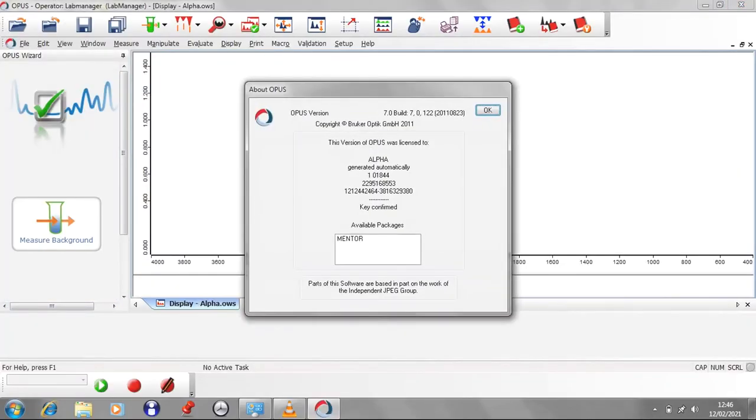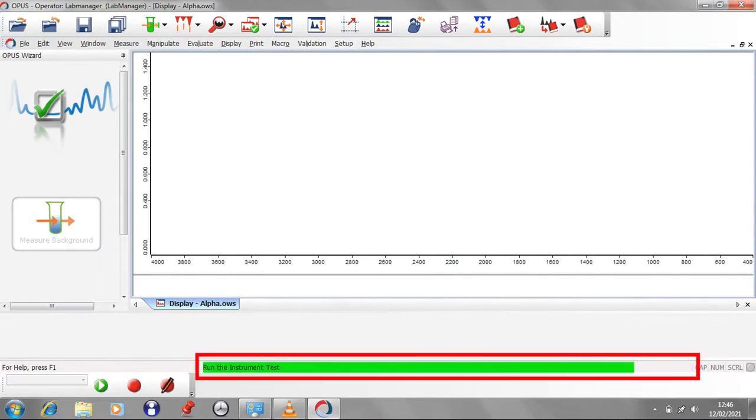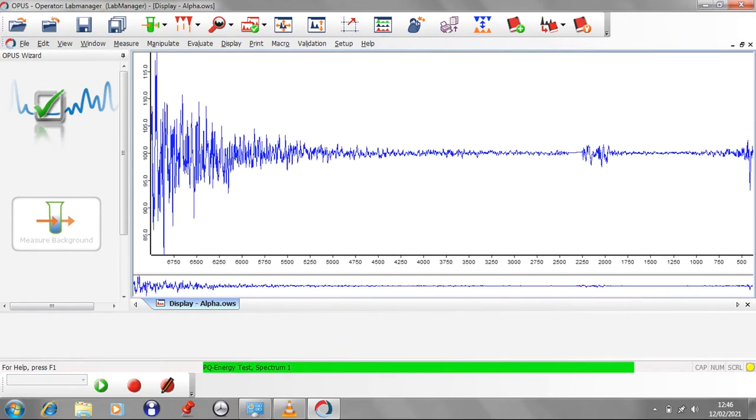Hit OK to close the welcome dialog box. The spectrometer will now go through some self-diagnostic tests which could take up to 10 or 15 minutes. The bar at the bottom of the screen will show you the progress of these tests.